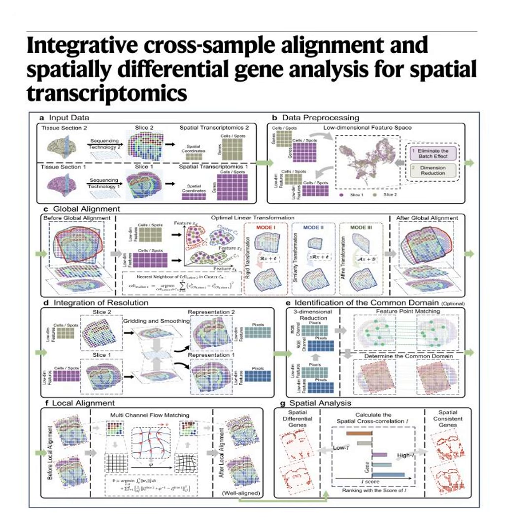Sure. So SCGs are spatially consistent genes. These are genes that stay in the exact same physical locations across different samples. Okay. You can think of them as your structural markers. You expect to find them forming the scaffolding of the tissue, whether that tissue is perfectly healthy or deeply diseased. They are the concrete buildings in our city map. They just don't move. Right.